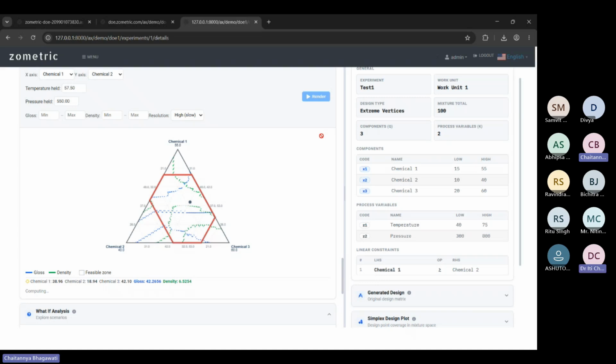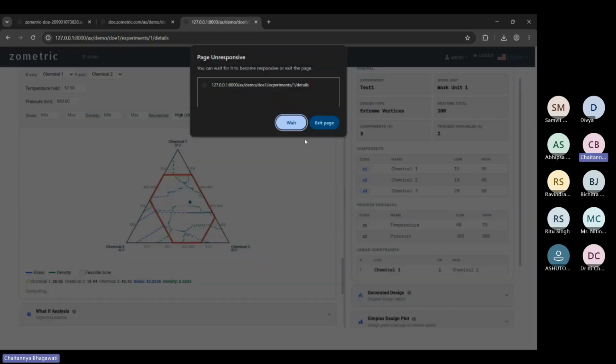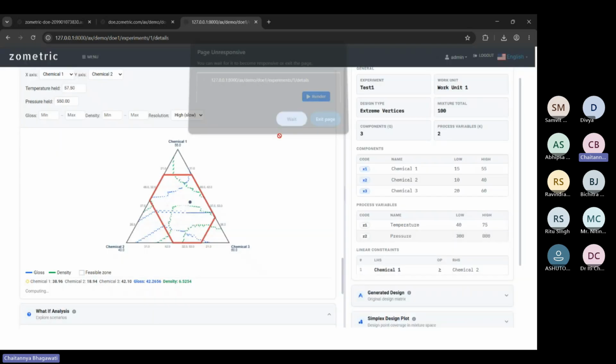So, better resolution of these graphs, this is the highest resolution possible. So better resolution will end up in smoother graph points for you, but the colors itself can't be changed.